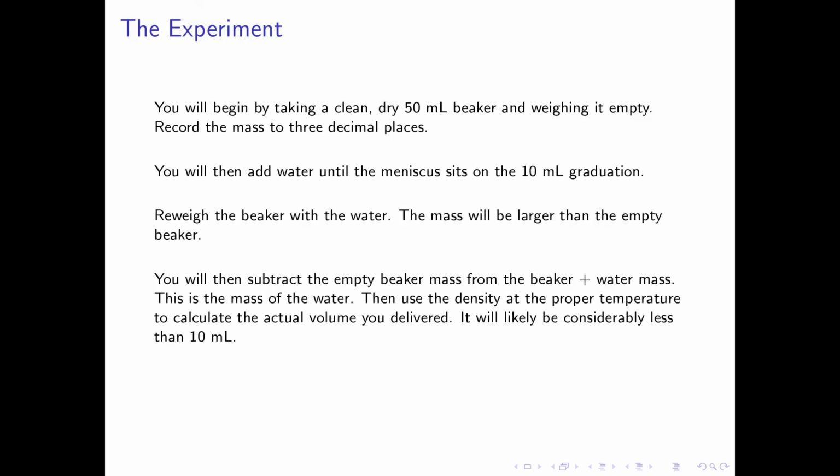Then, using the density of the water at the proper temperature, you can calculate the actual volume you delivered. In the case of the beaker, it will likely be considerably less than 10 milliliters. You will then clean and dry the beaker and repeat this process 2 more times.